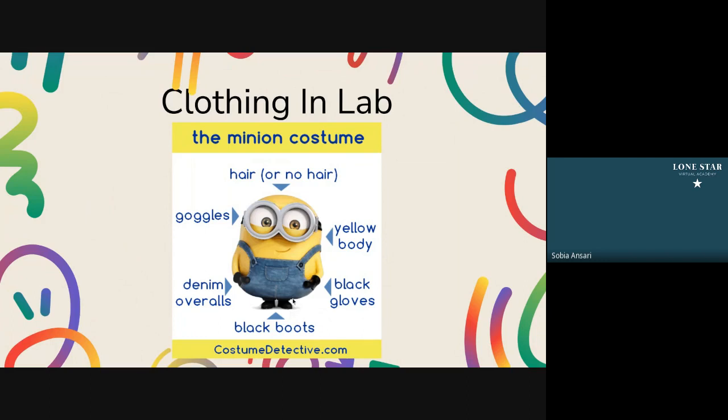Closed-toed shoes are also very important in case there is a spill, so you are not hurt by the spill, whether it's chemicals or fire. Also, notice there's no jewelry on. We generally avoid those in the lab as well.